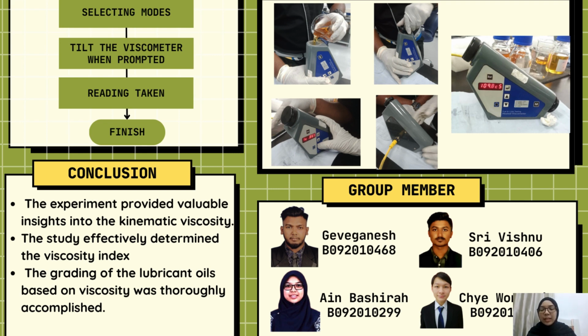Second, the study effectively determined the viscosity index of the lubricant samples, with sample A exhibiting a viscosity index of 99.38 while sample B has 99.08. This high value indicates a relatively stable viscosity across temperature changes, an important factor for lubricant use in environments with varying temperature.